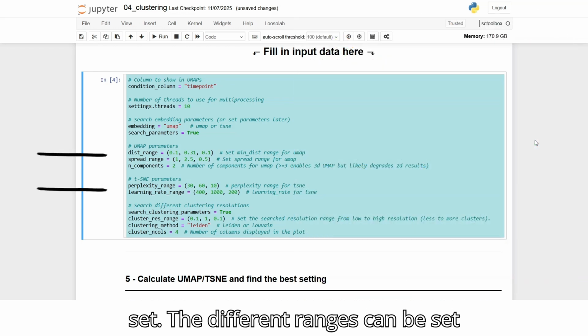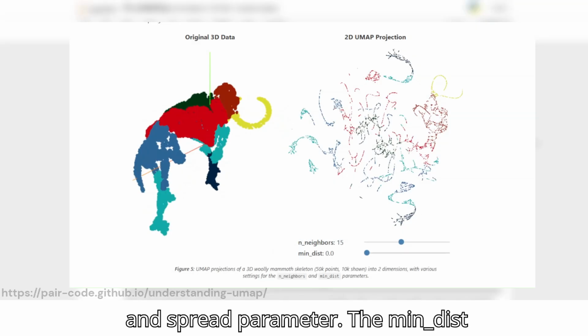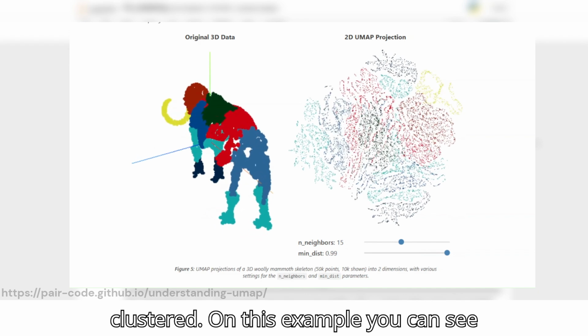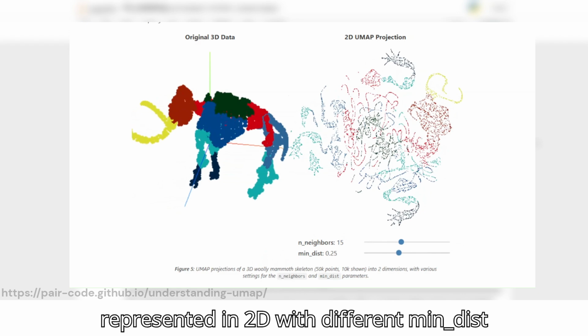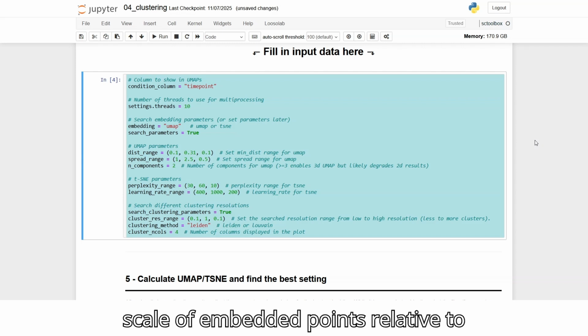The different ranges can be set here. For UMAP, this is the min_dist and spread parameter. The min_dist parameter sets the distances between points to make the plot look more clustered. On this example, you can see how a 3D visualization of a mammoth is represented in 2D with different min_dist parameters. The spread parameter sets the effective scale of embedded points relative to min_dist.